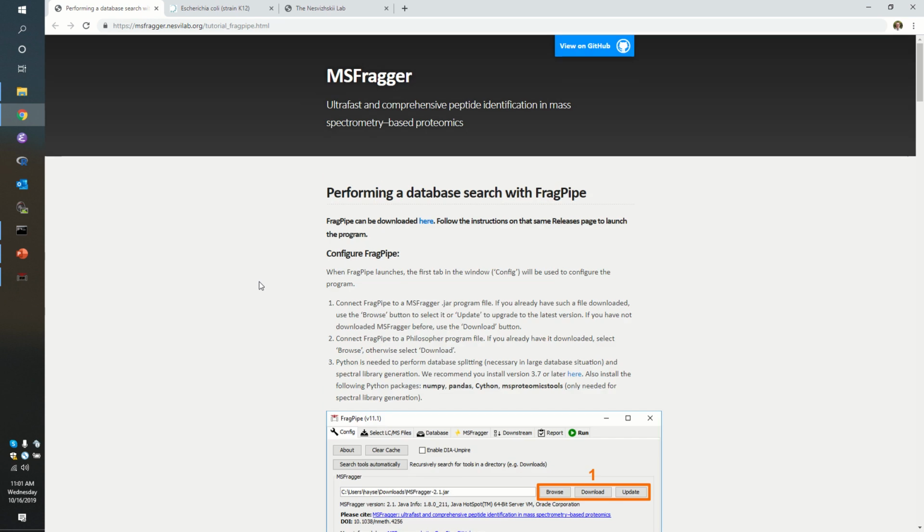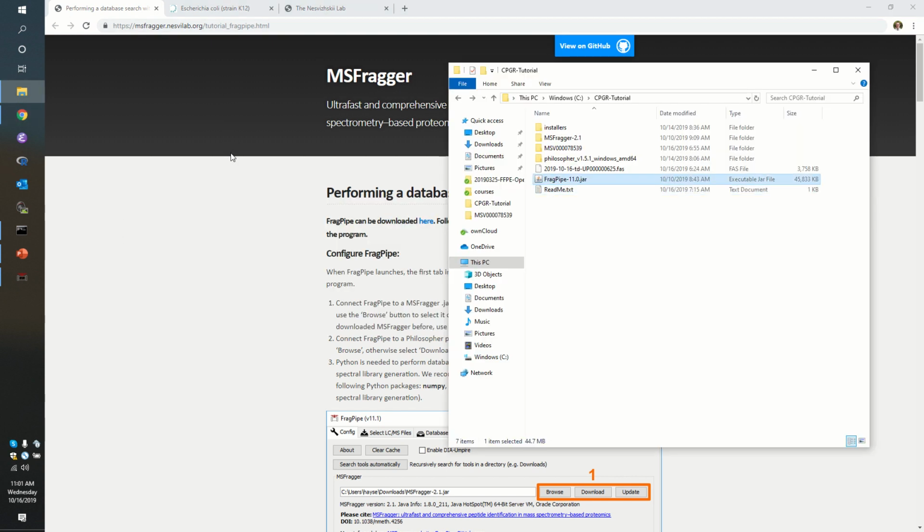We are going to diverge from this map quite a bit, so we'll just follow the path I've laid out today, but you can always do this one to refresh your skills in a slightly different context. Okay, so if we go through the directories, we see that we have a bunch of installers. Now, you didn't have to install any of this, hopefully, to make everything work on your machine.